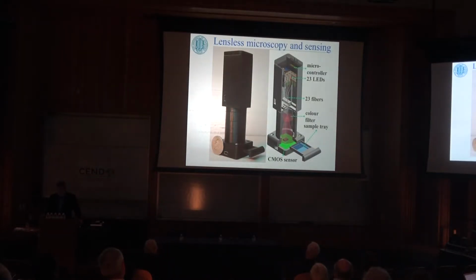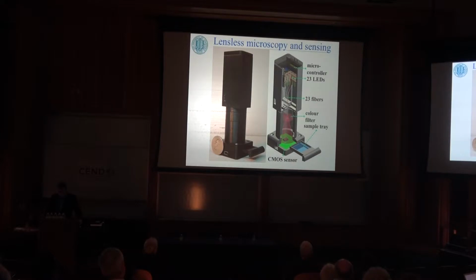If you look at one of those devices, actually it's very inexpensive and simple to put together. You have a CMOS imager taken off a smartphone. This is literally the same CMOS imager that many of your smartphones' camera interfaces have. We start with 5 megapixel images. Nowadays, we have maybe 20, 30 megapixel imagers. It's the same platform. The sample goes from the side. It's a transmissive sample. There are some LED lighting here.